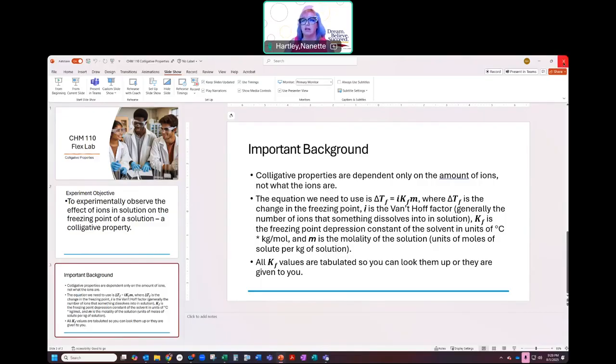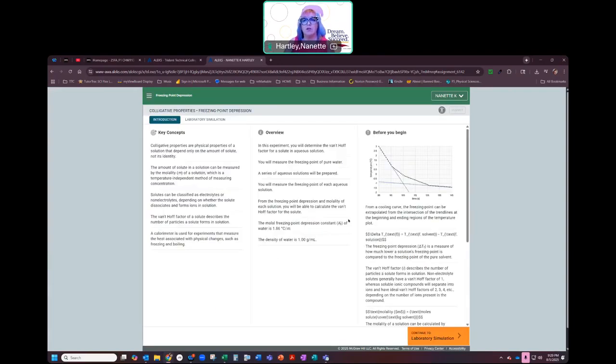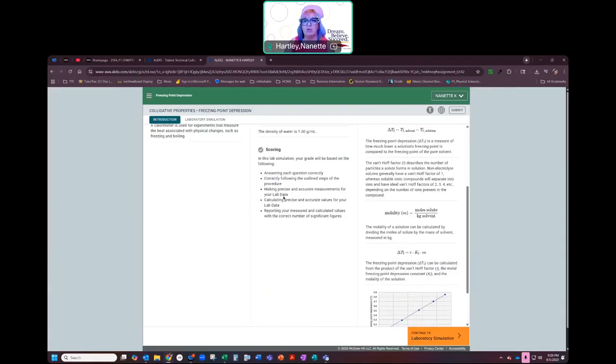So I'm going to close this out, and we're going to take a look at this freezing point depression lab. I'm going to go ahead and open this. And again, just like we always do, I'm going to start this. We'll get to some of our pain points, and there are a few pain points with this lab, some things that we need to talk about. So things that you will need to be able to look at when we're doing this.